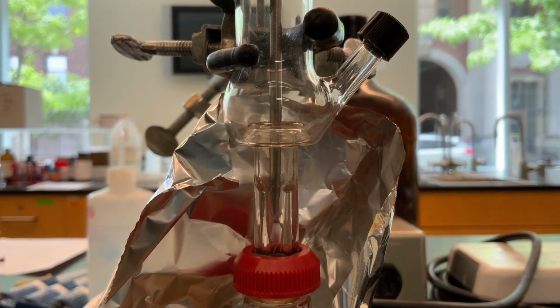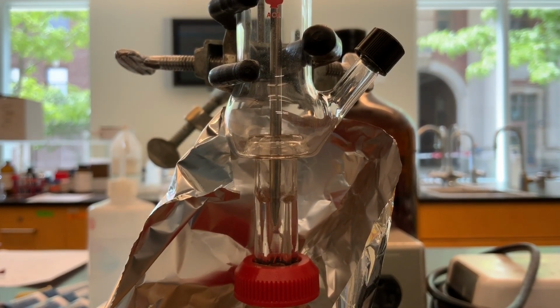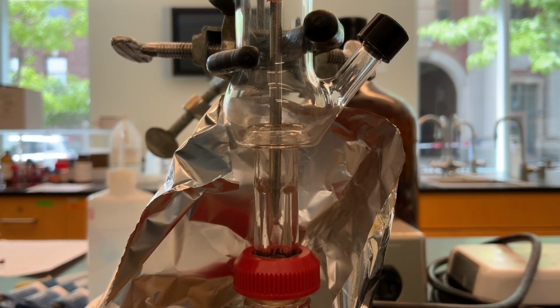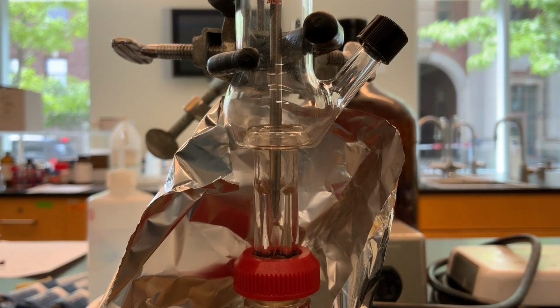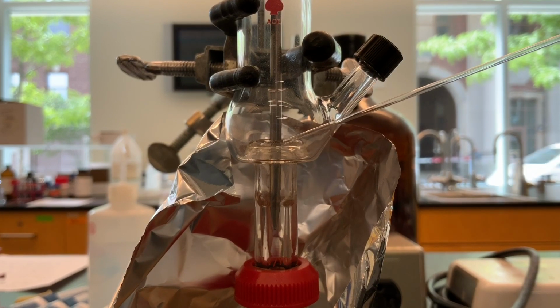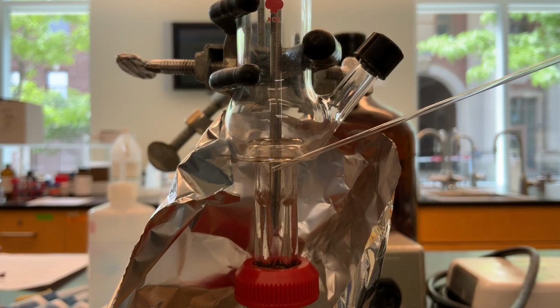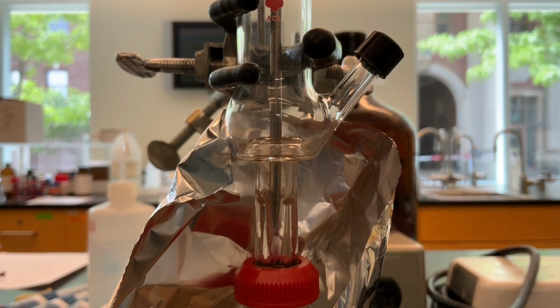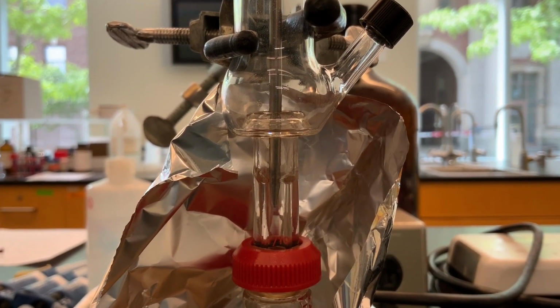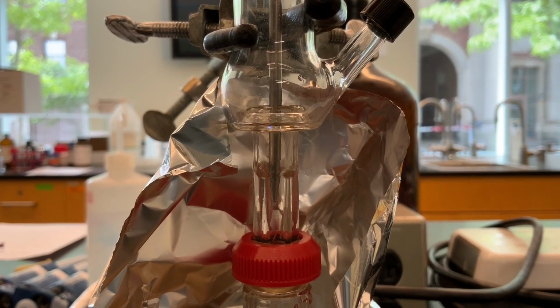So you see now it's climbing past it. The thermometer reads 70.3 degrees, which is fascinating. And here we see, okay, it's starting to reach the well. Once it starts spilling over, that's when we're going to record our temperature. All right, so here it's lifting, it's starting, so we're at 71.3 degrees. So we'll write that down in our notebook.